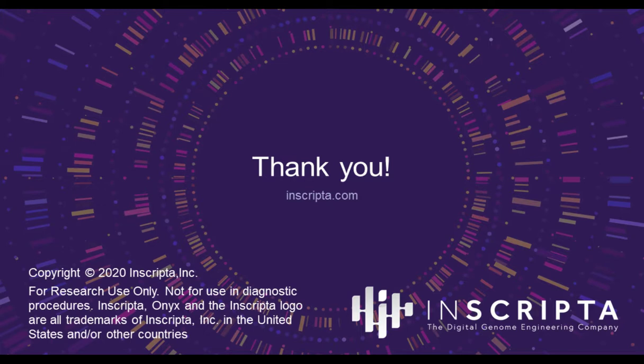And the kit we used for this particular study was just a standard QIAGEN DNA isolation kit. But we've also made an application note with lots more details around this particular data that I showed today. Please let me know if you want a copy of the application note, and I will be very happy to send it to you. There are lots of details about the methods and so on.